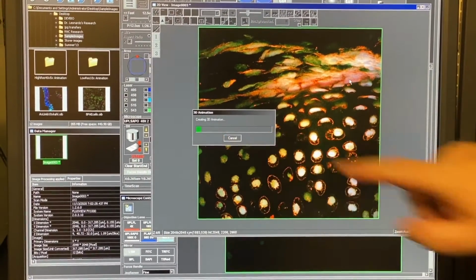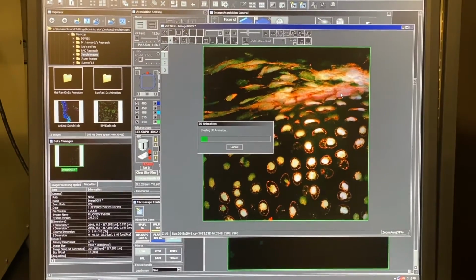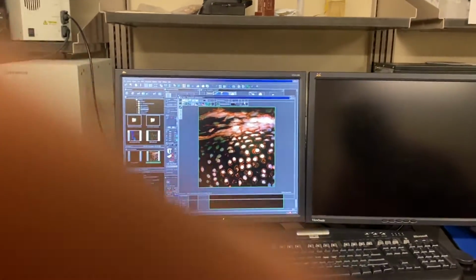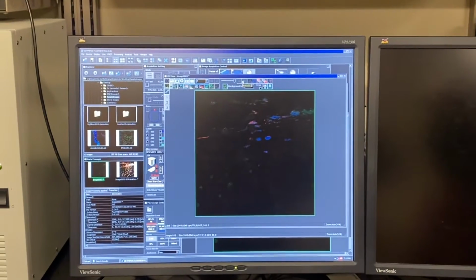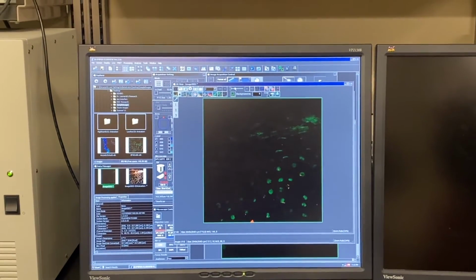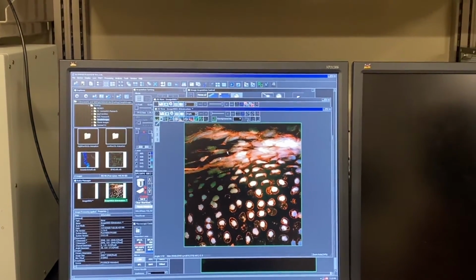And it's creating this 3D image that it will then show us, and I will be able to rotate it on the side. So this image just popped up. Behind it, it's got our individual sections, section, section, section, etc. from top to bottom. But now it's made a 3D animation.